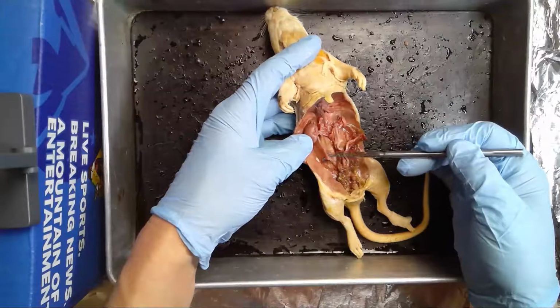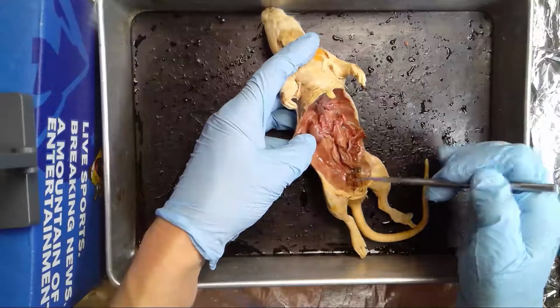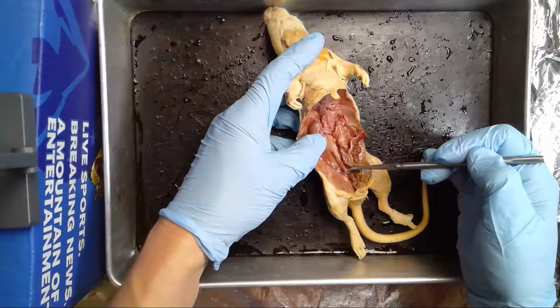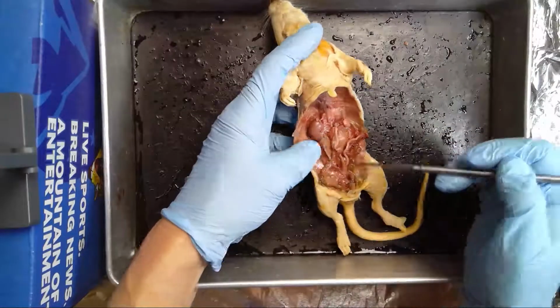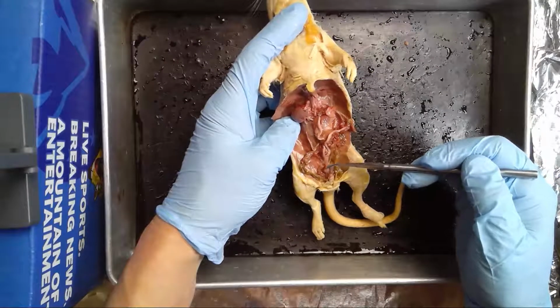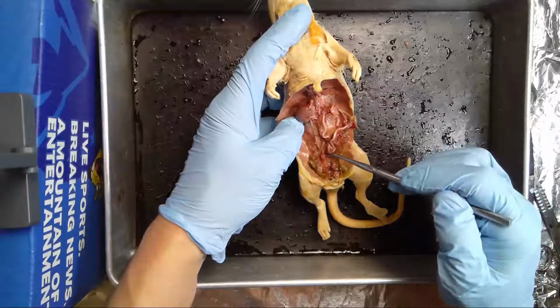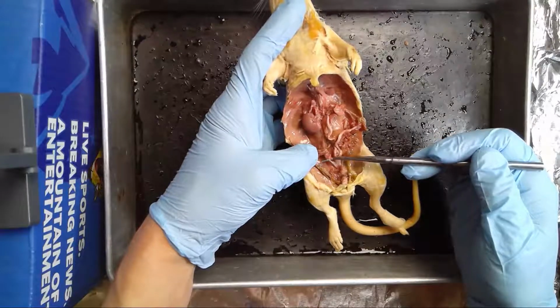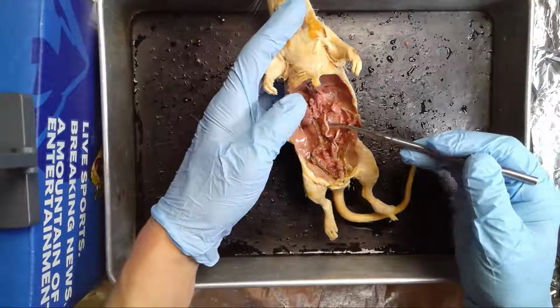Now there's a ureter that's going to carry the urine. And what I did is I sort of dissected it down just using this blunt probe to follow the ureter. So this is a tube, and it goes all the way down to this unpaired structure in the middle, which is the bladder. Well, the bladder is pretty small, but that's simply because it's not filled with anything. Okay, so you can actually see that this ureter, which is this white line here, actually goes all the way to the bladder. Okay, so that's enough for the kidneys.